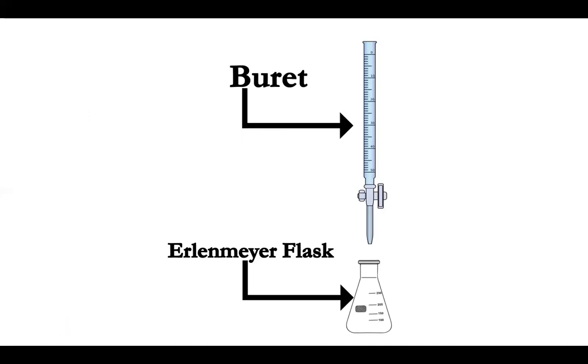So the different glassware that we use in titration reactions is a burette, which is this long, thin glassware here, where you see the numbers are actually in reverse. So when you fill it all the way up to the 0 marker, you know that you have 50 milliliters locked and loaded into the burette. And then as you open up the valve down here, you get droplets, or a stream will come out of the nozzle and drip into the Erlenmeyer flask.